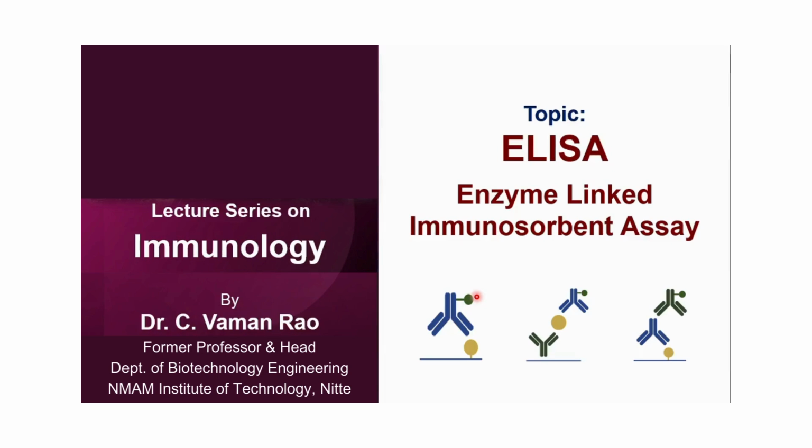I'm going to discuss another technique. In short form, it is called ELISA, which stands for enzyme-linked immunosorbent assay. It is also a sensitive assay, but compared to radioimmunoassay, it is not as sensitive, though much more sensitive than other immunoassays.